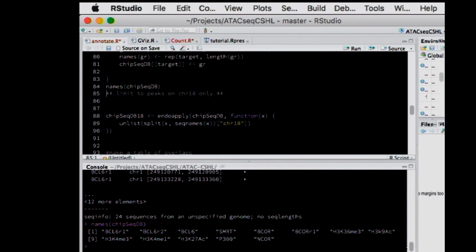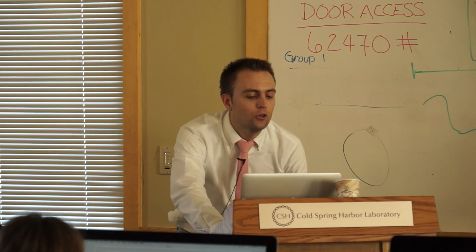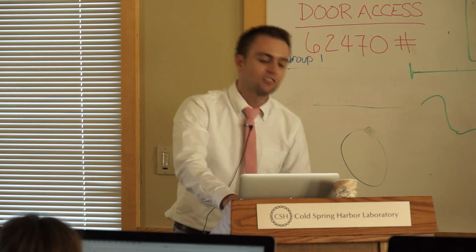I guess if the list were very long, the loop will probably take too long. So is there an alternative code? Yeah, you could, I didn't, but you could somewhat easily, because there's a lot of variables going on, use the apply functions.